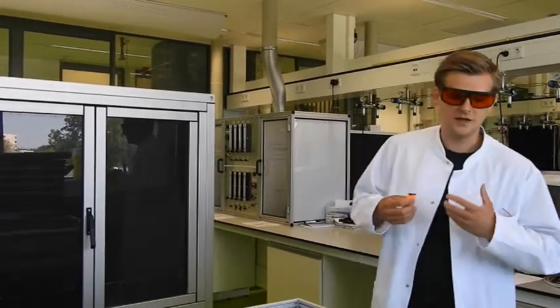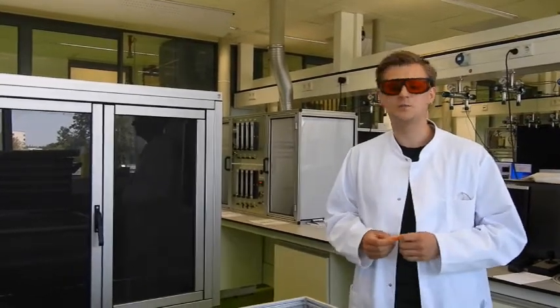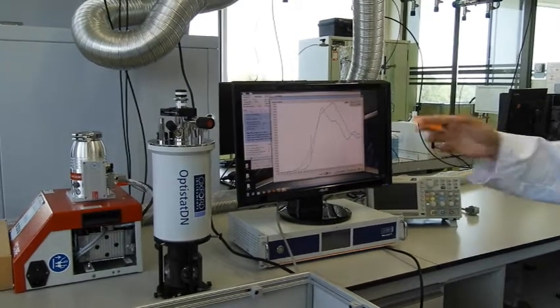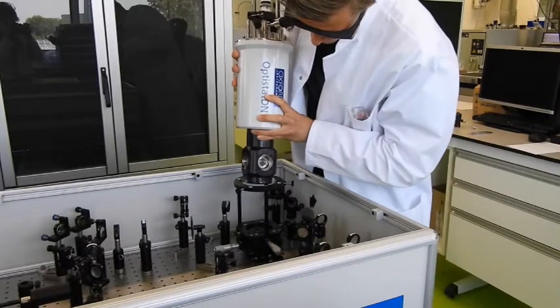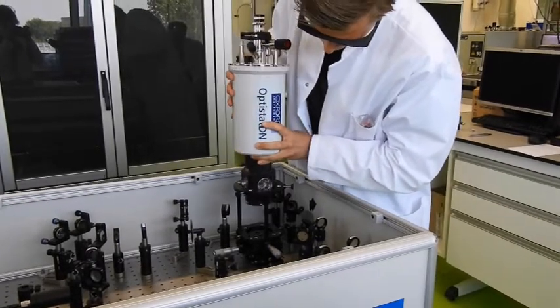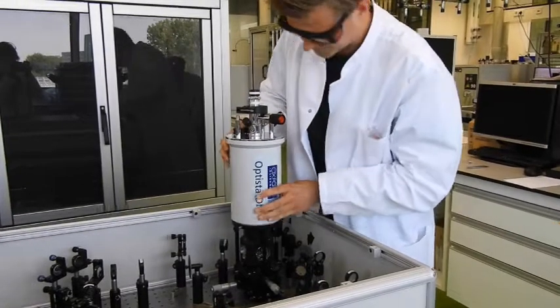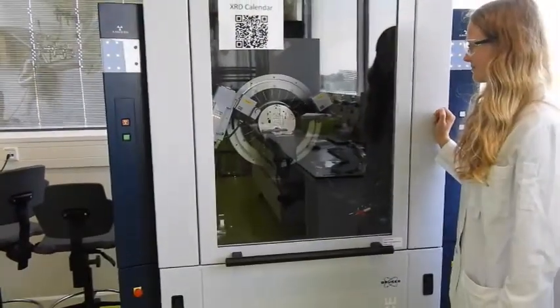And if we know how these charge carriers behave, then we might possibly favor these dynamics for a certain photocatalytic reaction. So another really cool feature is that we can place our photocatalyst materials inside this cryostat and place this inside the transient absorption setup so that we can also study the effect of temperature on the charge carrier dynamics.